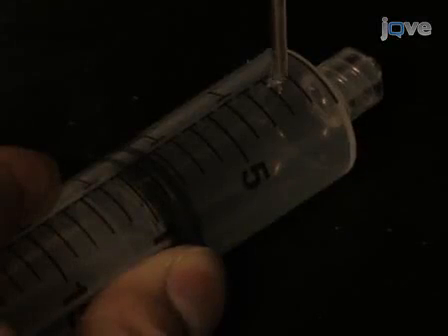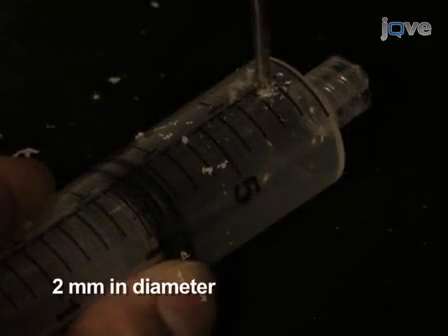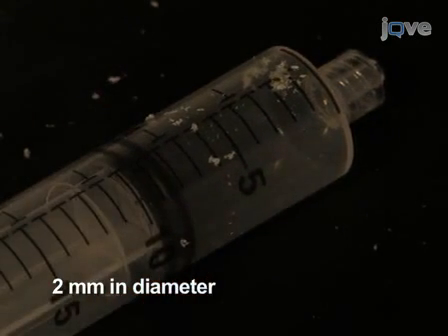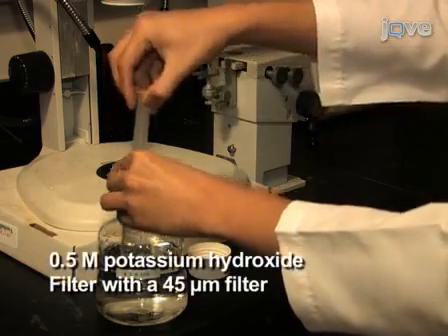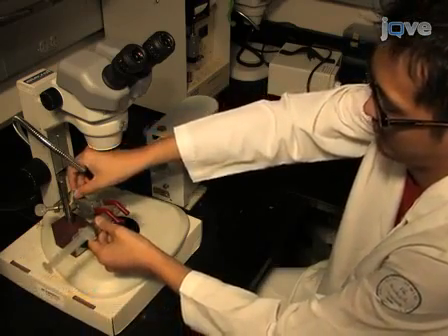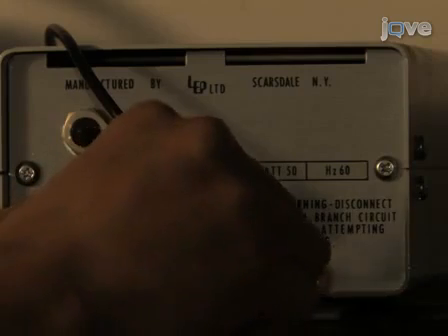Begin this procedure by sharpening the electrodes to be used for the recordings. Using a drill, make a small hole about two millimeters in diameter on the wall of a 20 milliliter syringe, one centimeter from the tip. Fill the syringe with filtered 0.5 molar potassium hydroxide and clamp it horizontally on a stand under a dissecting microscope with the tip in field of view. Push an electric wire into the hole on the syringe, ensuring that it does not block the syringe tip, and connect it to the anode of a power supply.